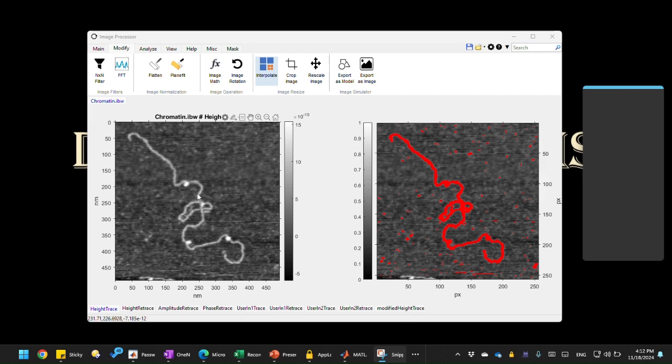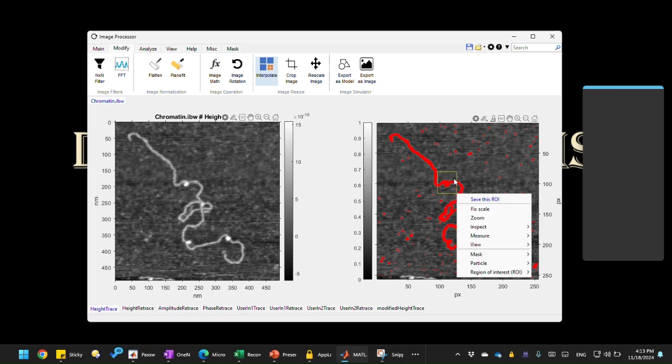What we want to do is create cutouts for these three complexes and analyze, for example, a cutout like this, and analyze the mask inside this box.